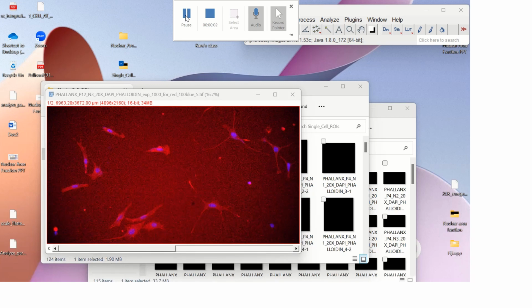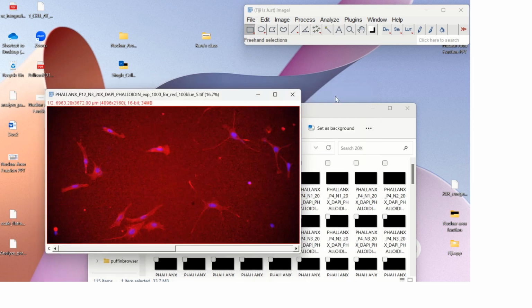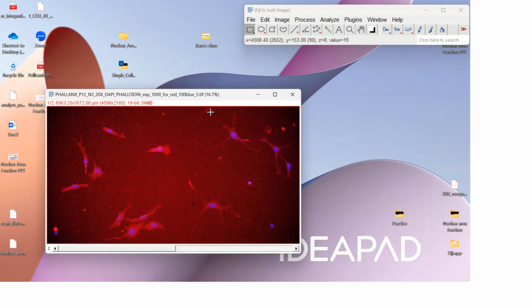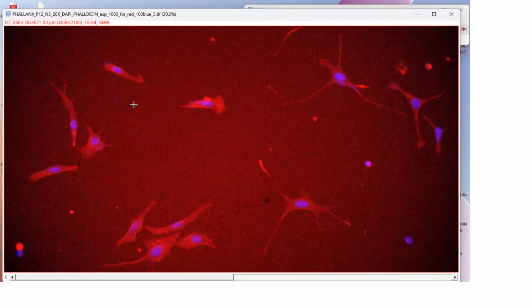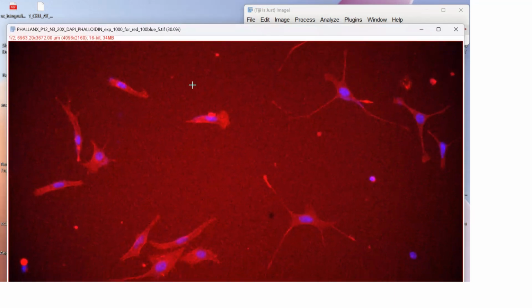Okay, so today we're going to start the analysis portion of these cells. So here is my Fiji. Once you have your Fiji open, you can go ahead and get started. You open up your first image, and then basically I'm going to make this a little bigger so you can see. I have selected my square tool right now, this square one, so that I can select squares.